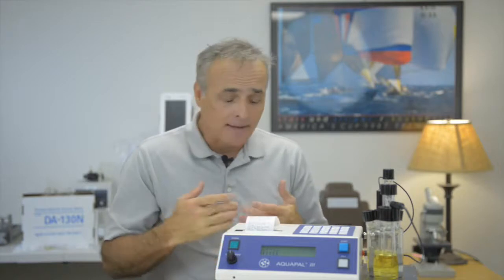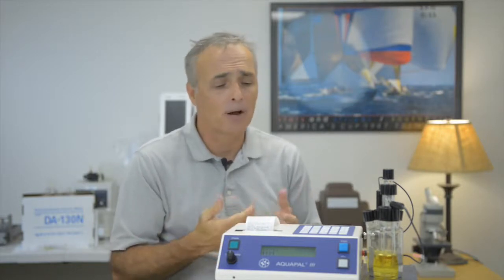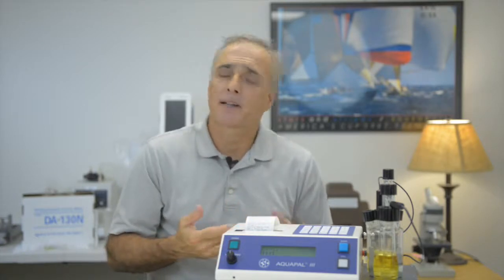I wanted to go into a little bit further discussion as to why we would want to use specific gravity, or why some organizations use specific gravity. Weight is the preferred method for getting really accurate results. We weigh our sample on a 4-place balance. We enter the beginning weight and the ending weight, and that's usually how a lot of people do it. However, if you're in an environment where you don't have a place for an analytical balance, specific gravity is a great alternative. So what is specific gravity?